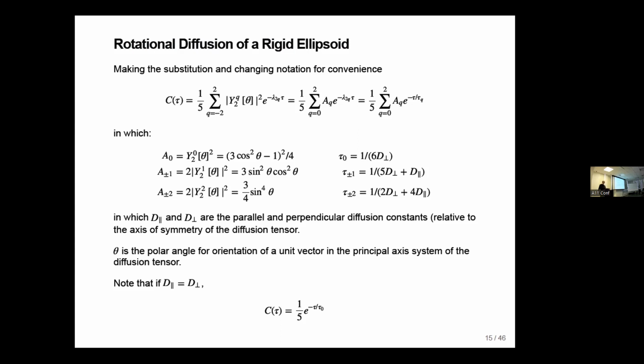So analyzing the internal dynamics then becomes much more complicated. It's mostly ignored when we're analyzing N15 relaxation, but as the measurements become more and more precise, then this becomes an issue.